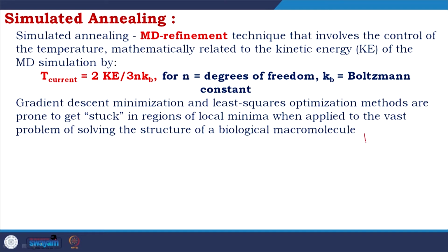So, suppose we are talking about a protein. I talk about that there are different minimas: minima 1, minima 2, minima 3, minima 4, other minimas there.